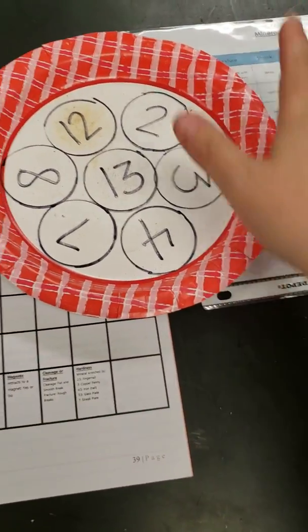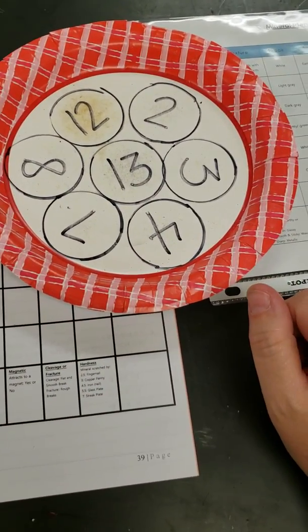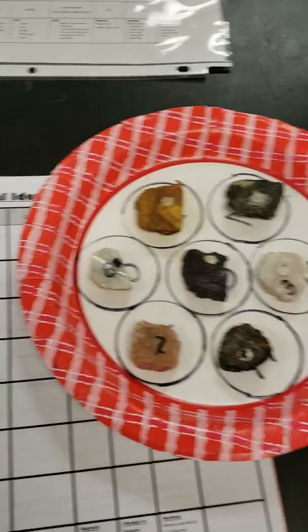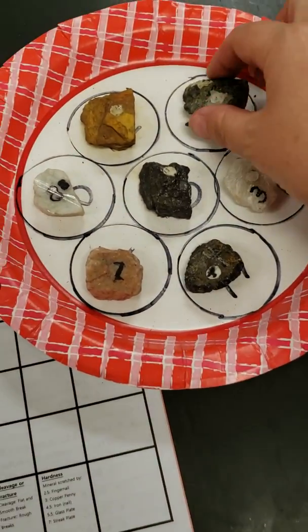Okay, so what we're going to do is get the minerals on this beautiful plate. Hold, please. And there we go. Okay, so I'm just going to start with mineral number 2, and that is going to be this one. And we should fill out the color.